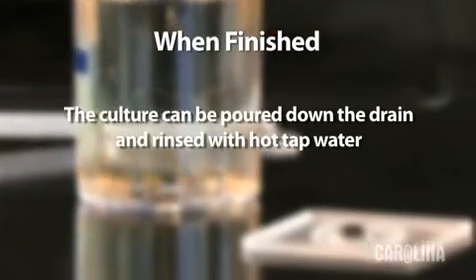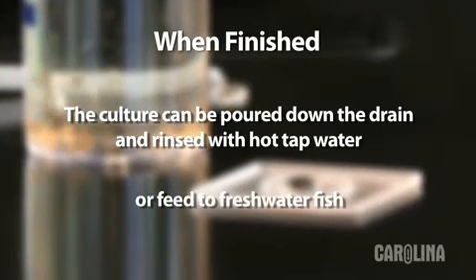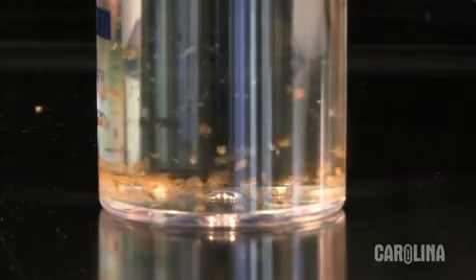When finished, the culture can be poured down the drain and rinsed with hot tap water. Or you can feed them to freshwater fish in a classroom aquarium. Gradually the culture will begin to die off — this is to be expected unless you provide a larger habitat or more food.